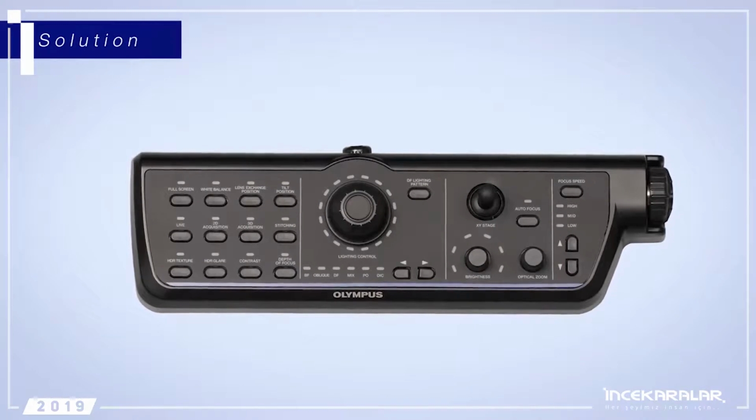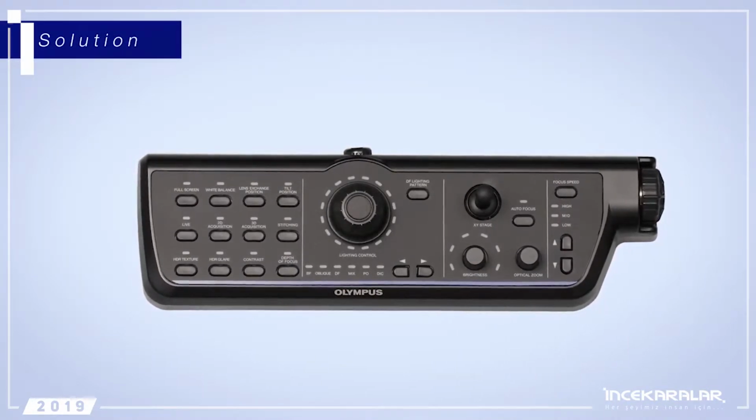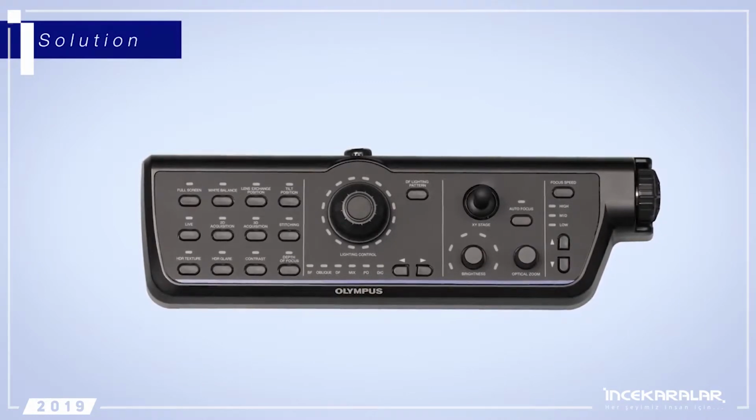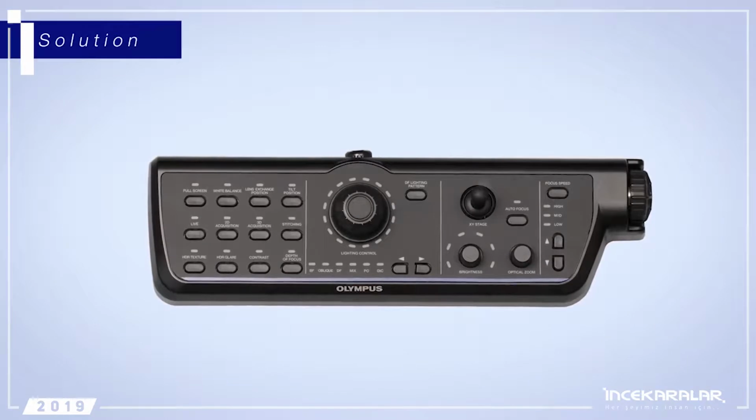The DSX1000 does not require expert knowledge because it's simple to operate. Anyone can instantly switch observation methods by only pressing buttons on the console controller.